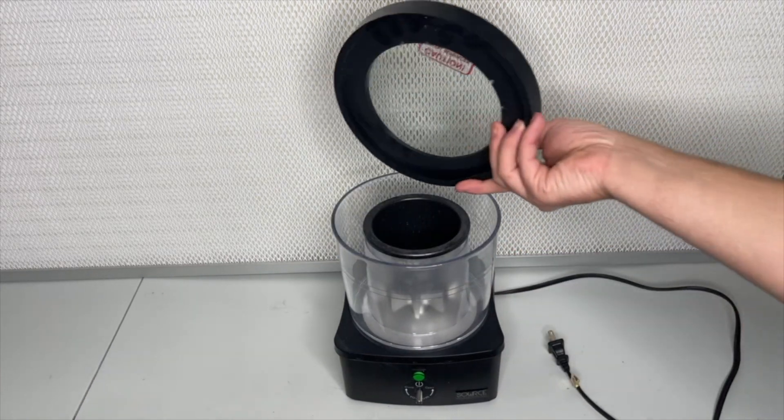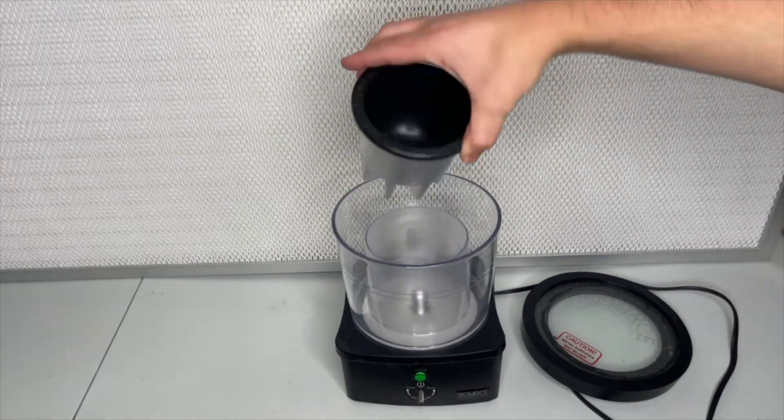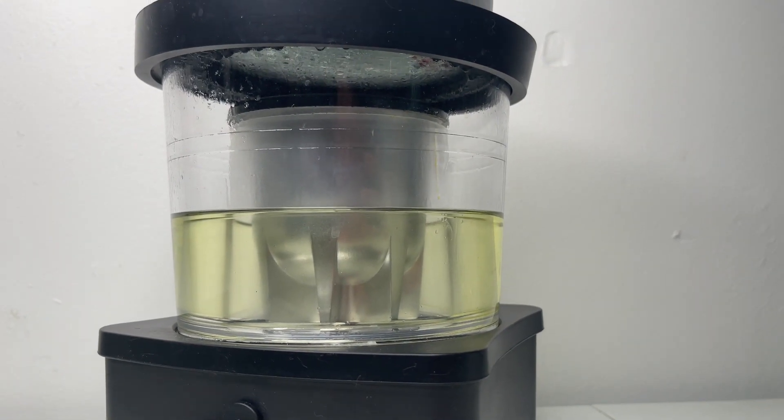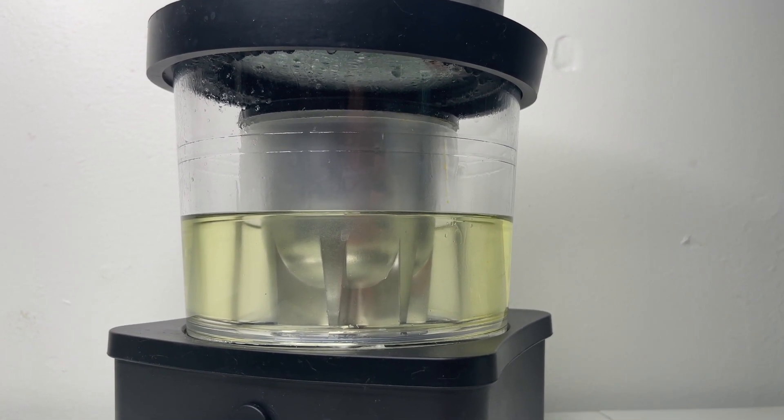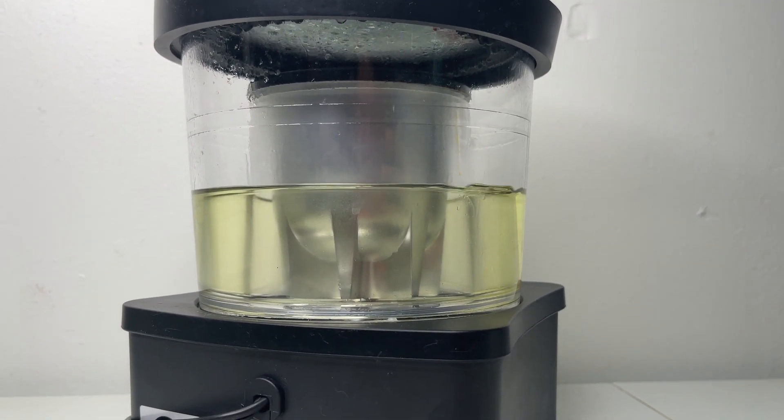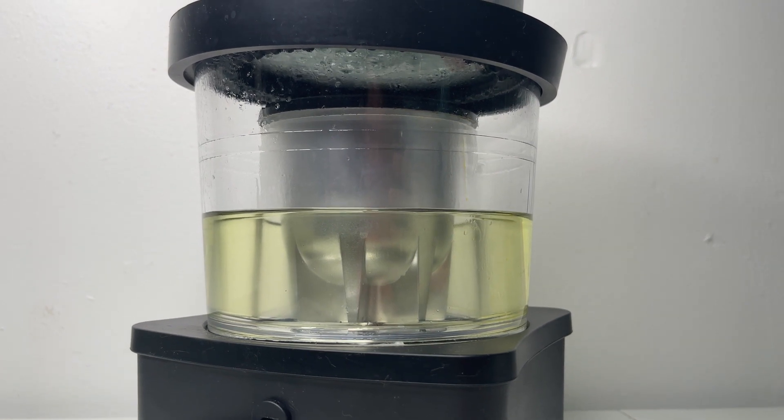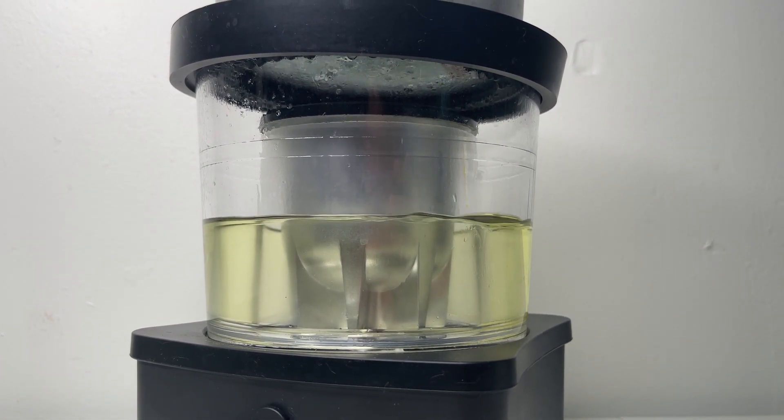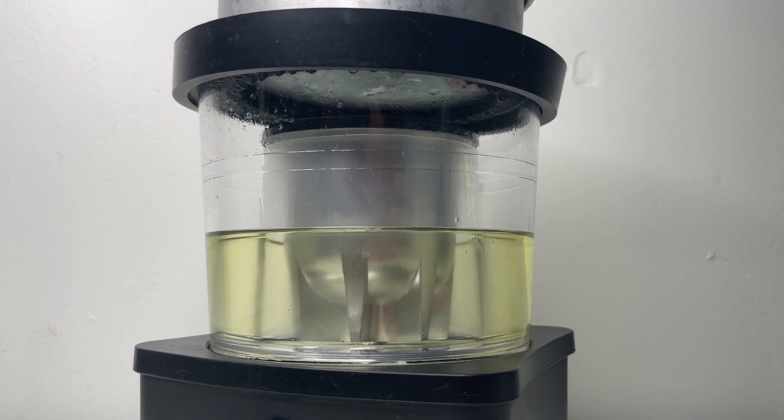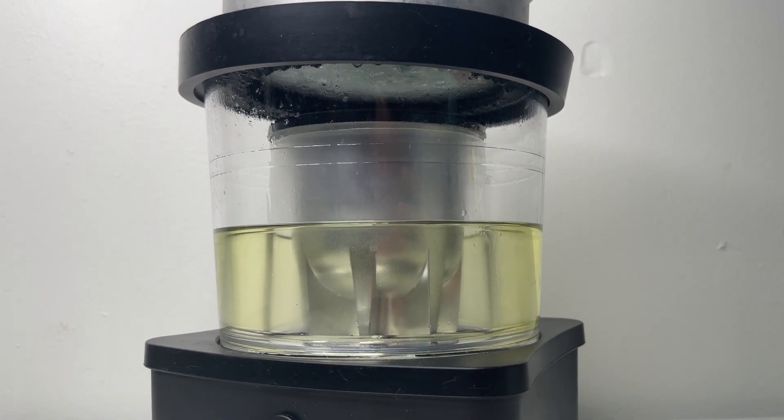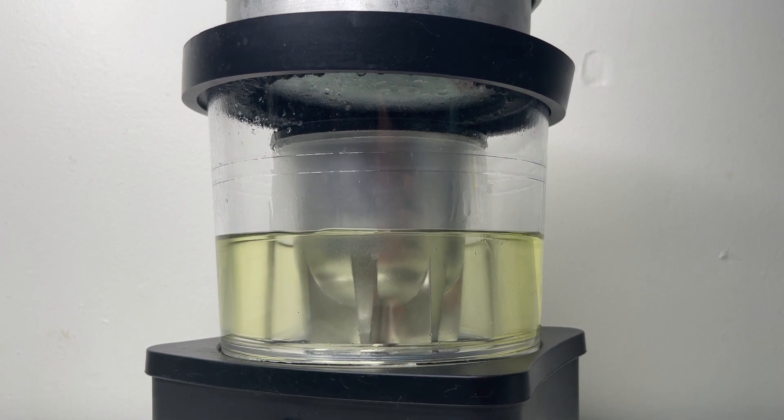This is another one of my machines that I use to make my medicinal mushroom powdered extract. It's called the Source Turbo by Extract Craft, and it's a vacuum distillation machine. If you soak the medicinal mushrooms in high proof alcohol, you can distill off the alcohol and leave behind the medicinal oil, and then you can reuse the alcohol for more extractions. It's a little pricey at around I think it was $500 or something, but for someone who really loves making extracts, this is a perfect machine.